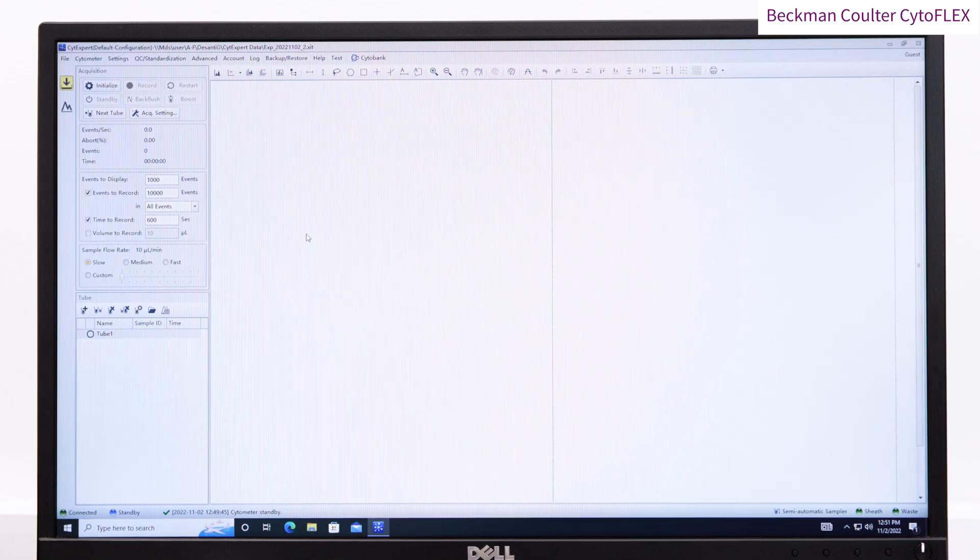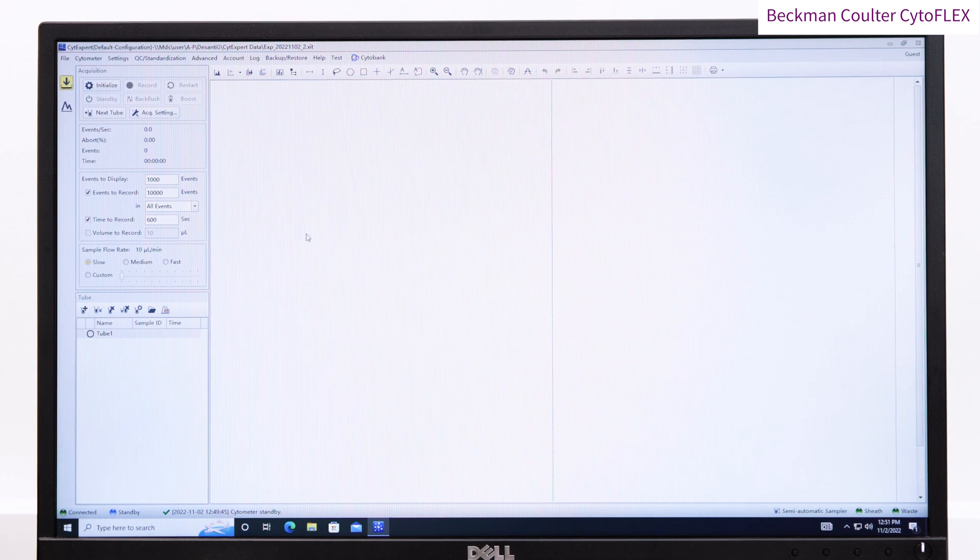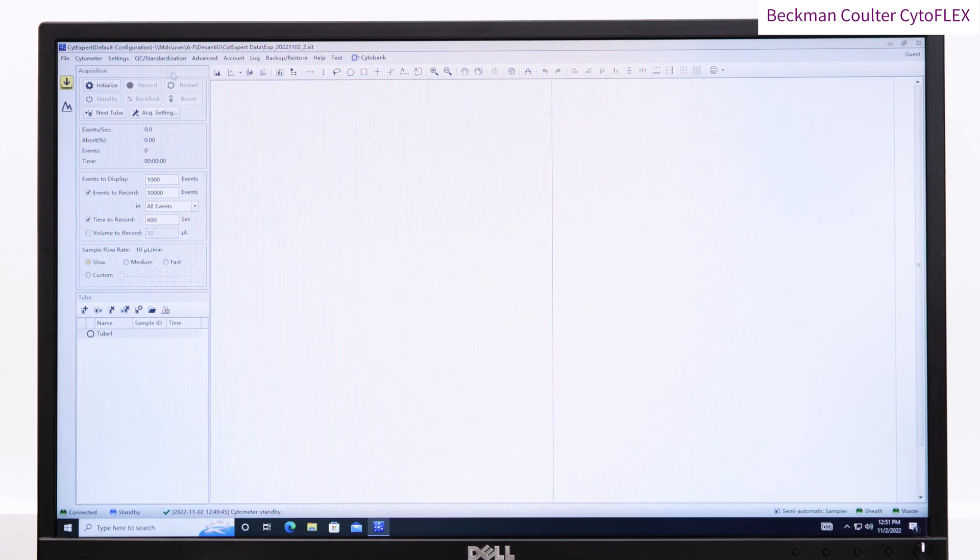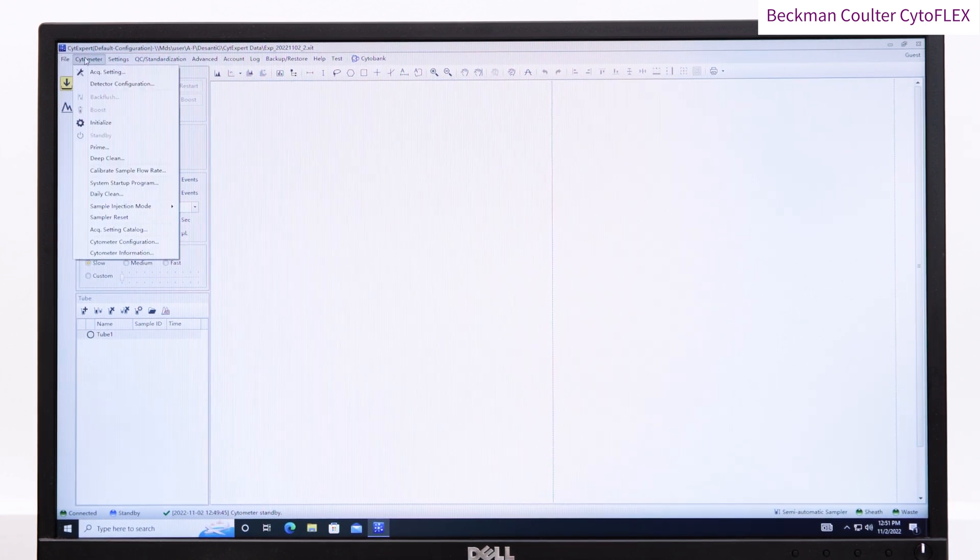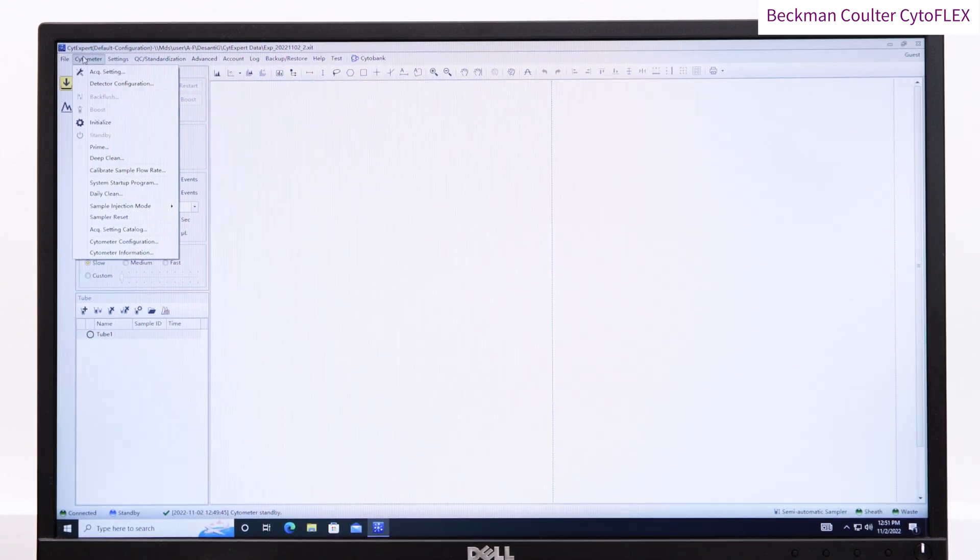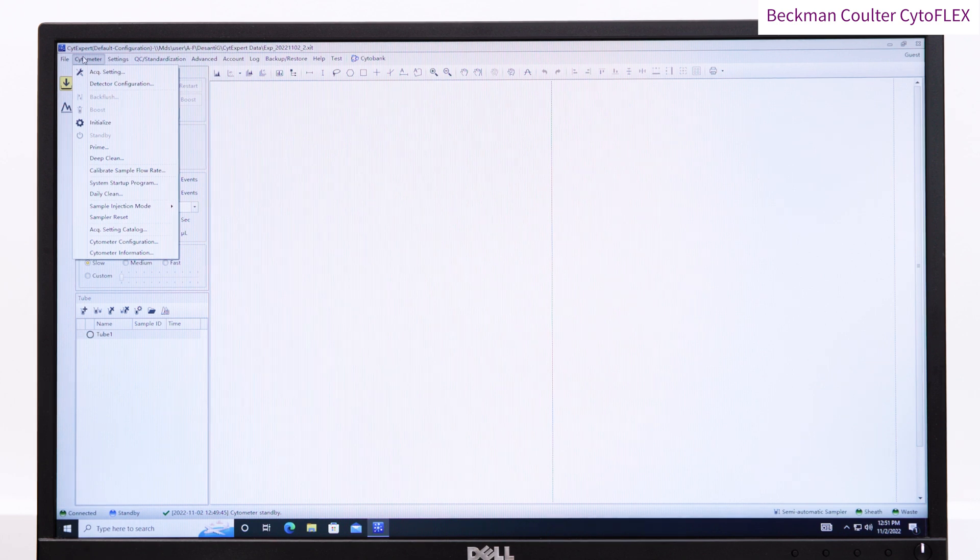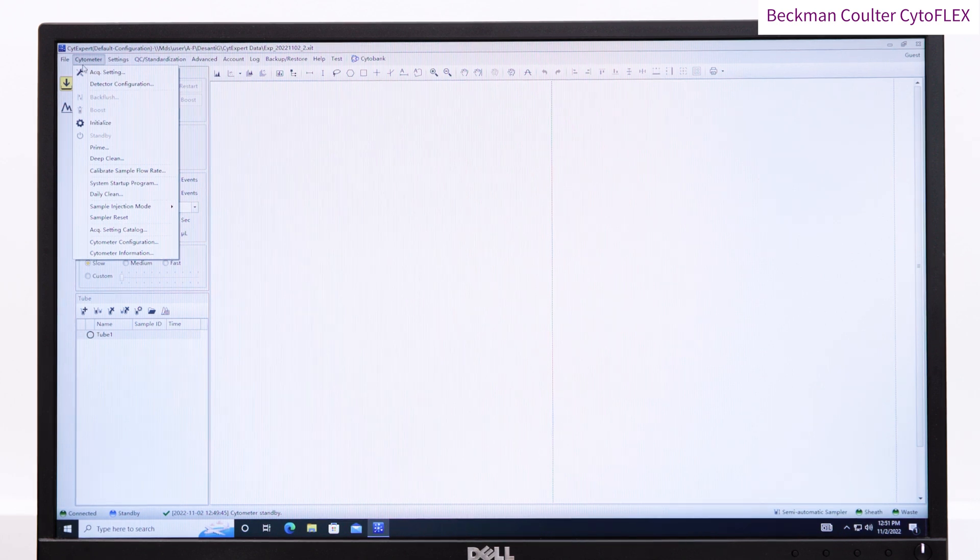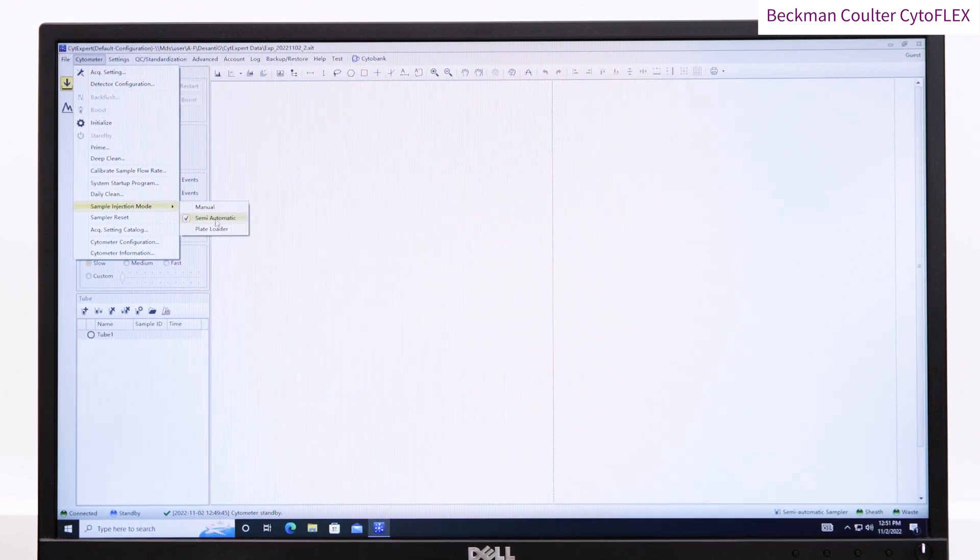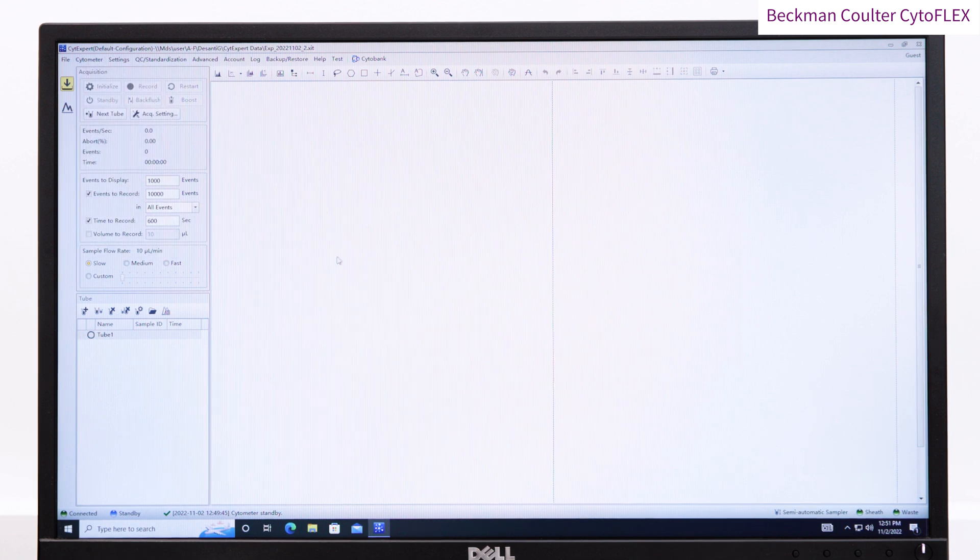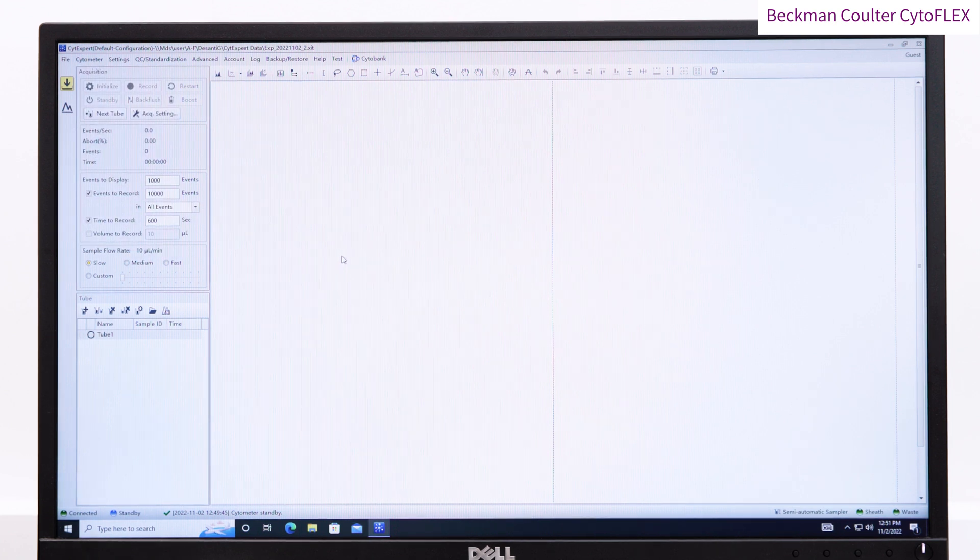Check the machine is in the correct mode on the bottom right of the software. If you are using tubes, the machine should be in semi-automatic mode. But if you are using plates, then it should be in plate mode. We want to switch to plate mode here, so go to the cytometer menu and choose the correct mode.